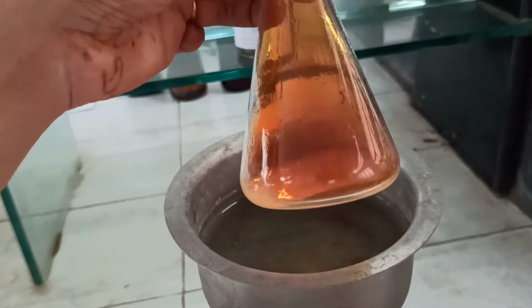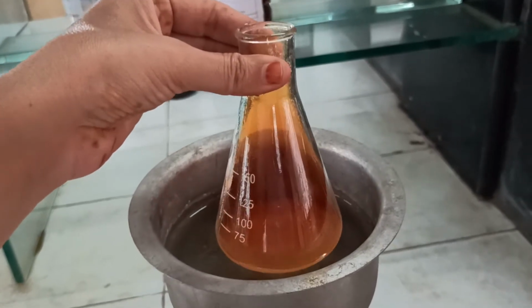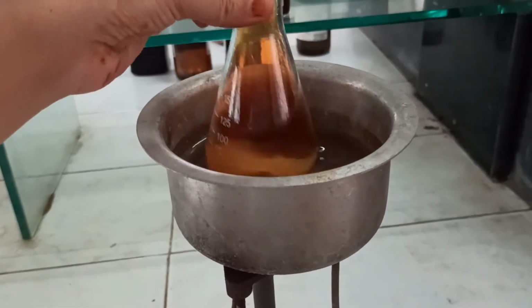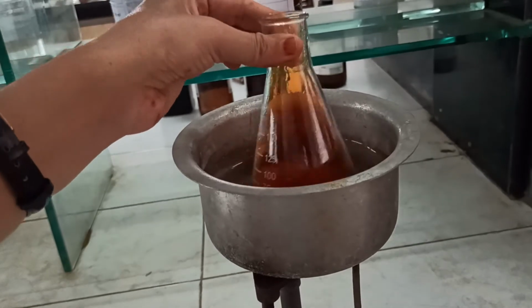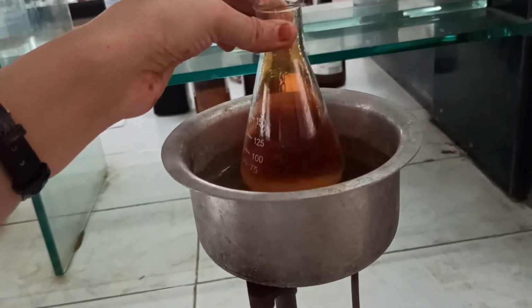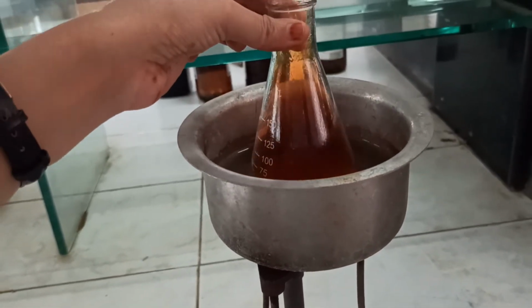You can note the change in consistency and color of the reaction mixture. Further, we have to heat it for 30 more minutes.